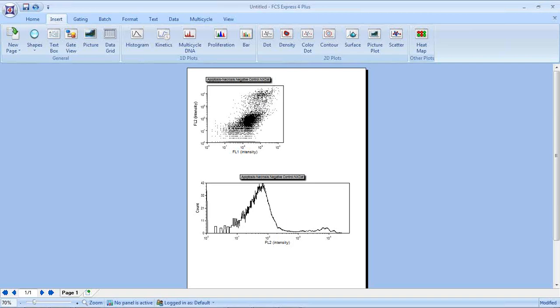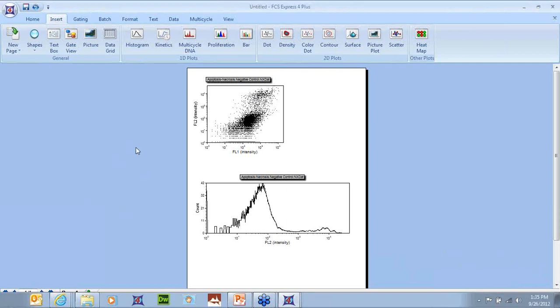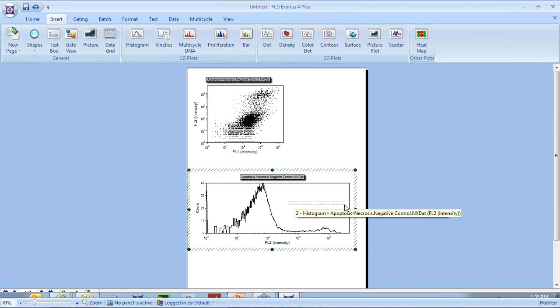And to deal with this type of thing, looking at multi-parametric data and trying to figure out what populations are what, we do in flow cytometry something called gating. If people are familiar with flow cytometry, everybody knows what gating is. But for those of you who come from more of an imaging background, gating is actually something akin to creating thresholds for your data. So in the imaging world, we would say if we want to look at the cells that are positive for FL2, we would come in and create a marker and look at only the cells that are within this region of the threshold.